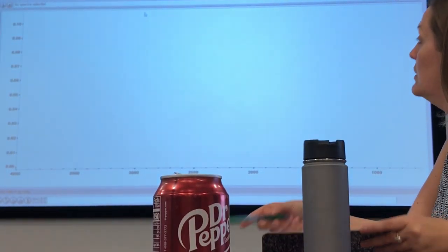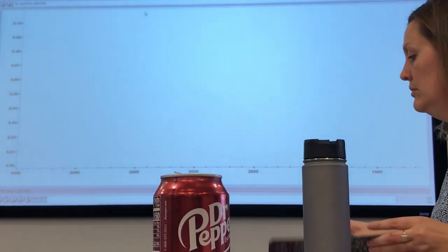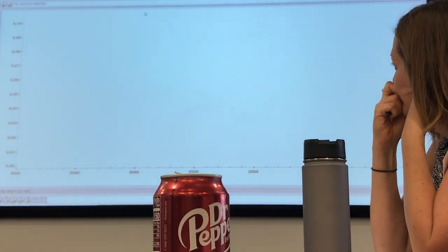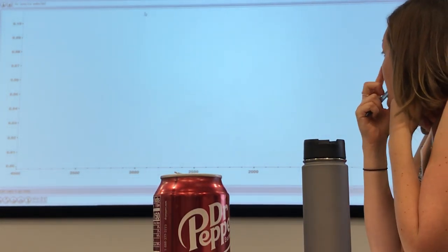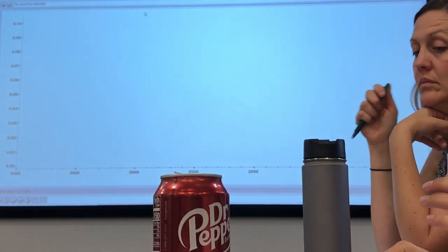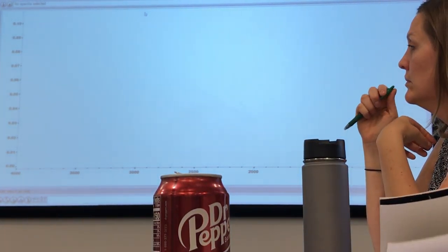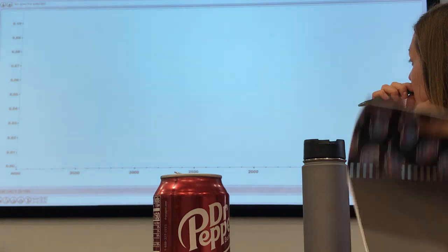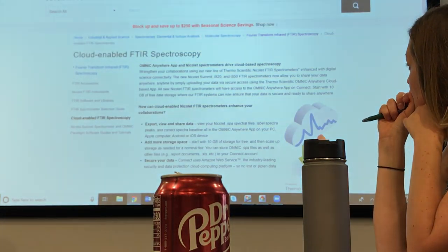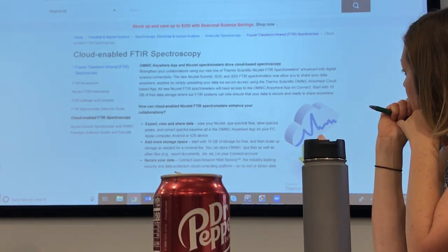One of the nicest things you can do, if you have just measured 10 spectra up here and want to take them back to your own labs to make nice pictures and create reports, is that you don't really have to stick to the instrument software. You just save the .spa files, copy them, take them back, and you can use the Omnic in cloud feature. Basically, this allows you to take IR spectroscopy anywhere you want.